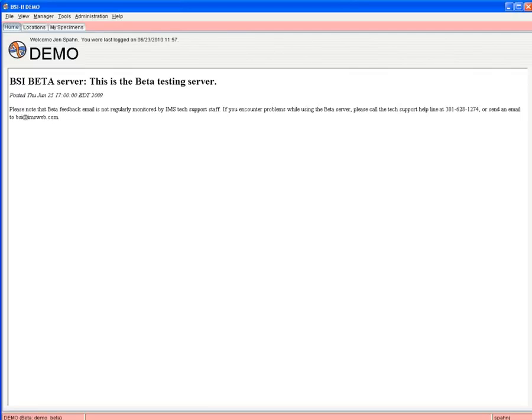Welcome to Webinar 1 for BSI version 7.2. We're going to go over the BSI EZ interface and changes to locations in this webinar.